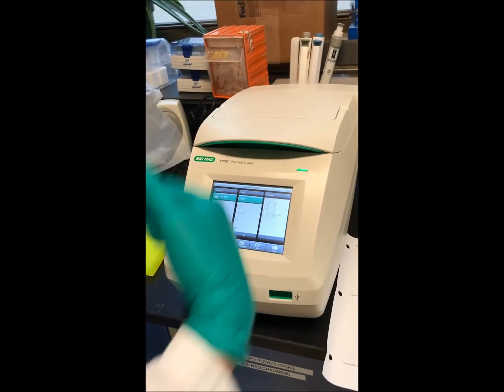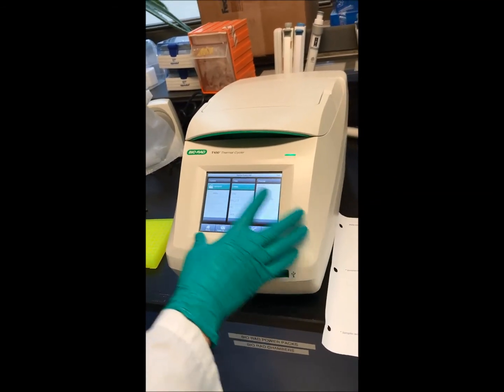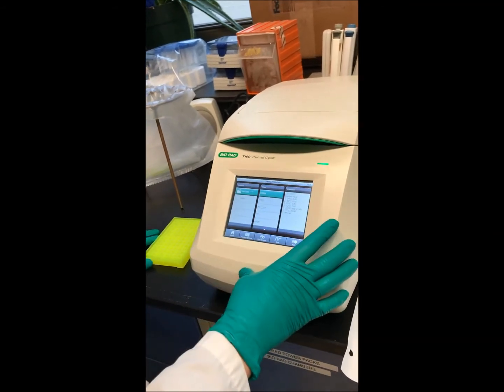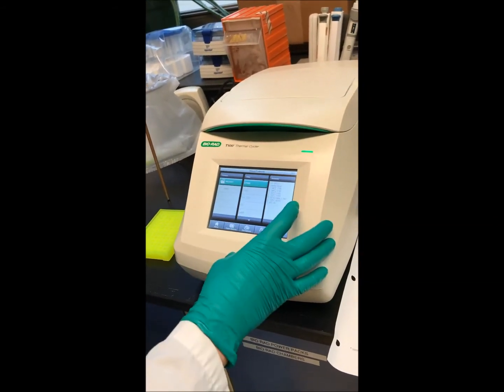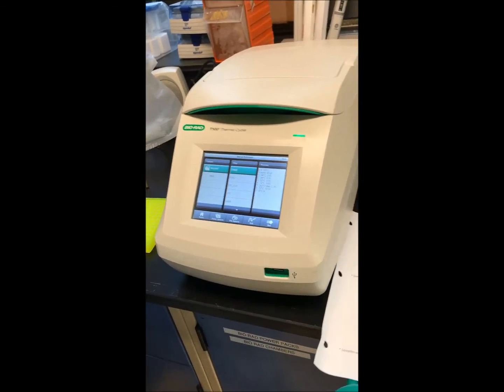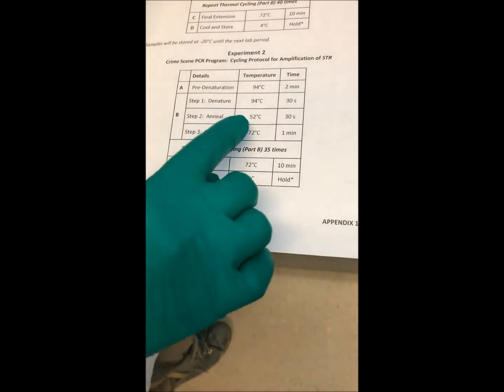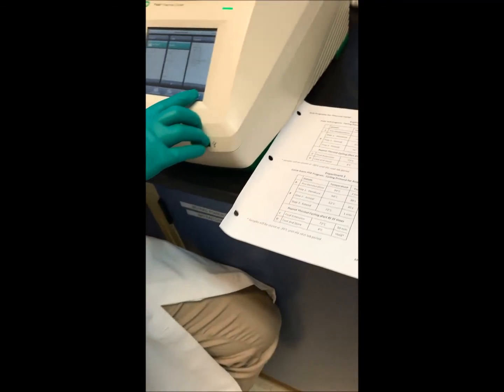And like I said previously, it's a thermocycler, so it will raise and lower the temperature automatically. The first step is just boiling for 2 minutes, and then it's cycles that are repeated 34 times with 3 steps each. The first step is denaturation, boiling. Second step, annealing. It's done at 52 degrees, and extension at 72. And the timings are written there. So this is repeated 35 times, sorry. And then at the end, there's a final extension to make sure that all the fragments have maximum size. And all we need to do now is press run.